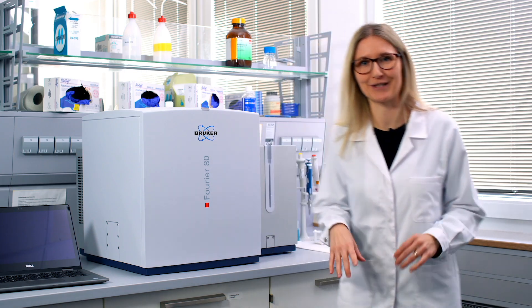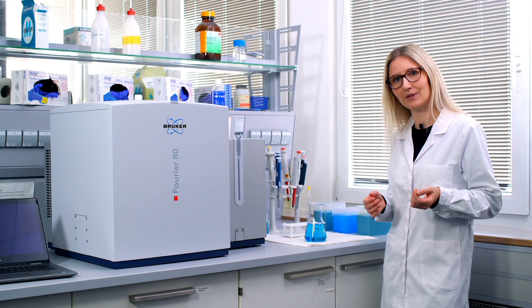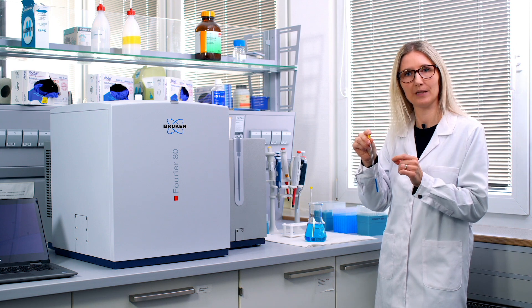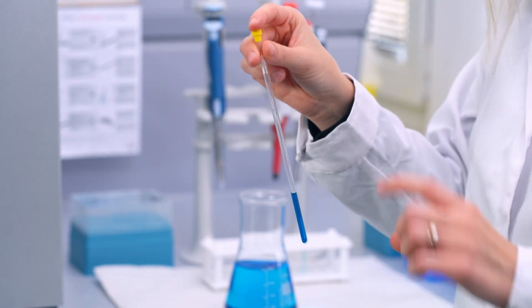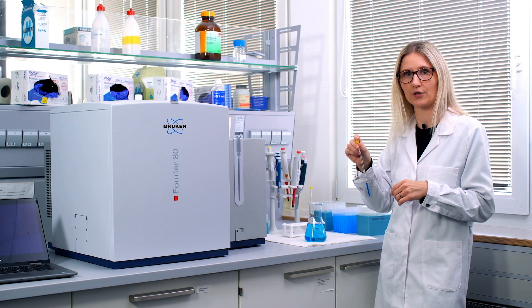But coming back to the practical part. If you want to measure an NMR sample, you just take standard seven inch long tubes with an outer diameter of five millimeters. Really the standard that you are used to from high field NMR systems. And you fill about 600 microliters of your sample inside such an NMR tube.